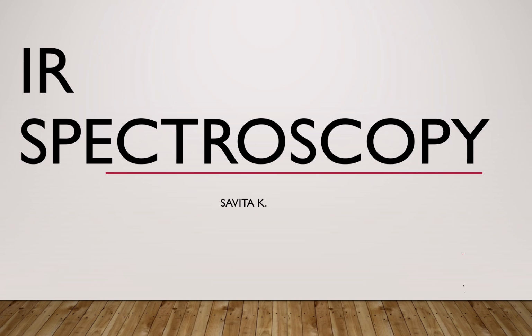In this video, I will be explaining IR spectroscopy, the basic principle of IR spectroscopy, what happens when an organic molecule absorbs IR radiation, what the different fundamental modes of vibrations in IR spectroscopy are, what combination frequency is, and Fermi resonance.